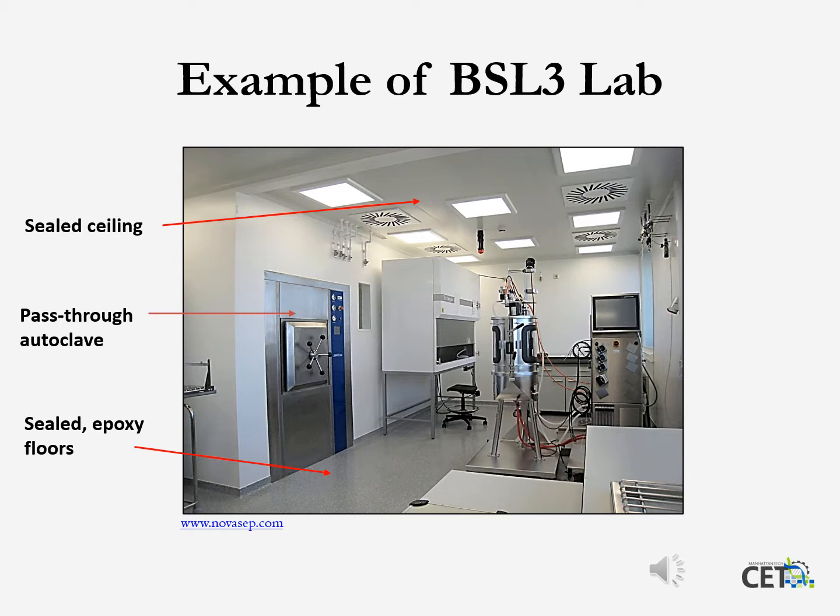Working in a BSL-3 requires extra safety equipment: a total body Tyvek, that's the type of material. It looks like a worker's overalls, and sometimes a PAPR, that's their respiratory system, must be used.